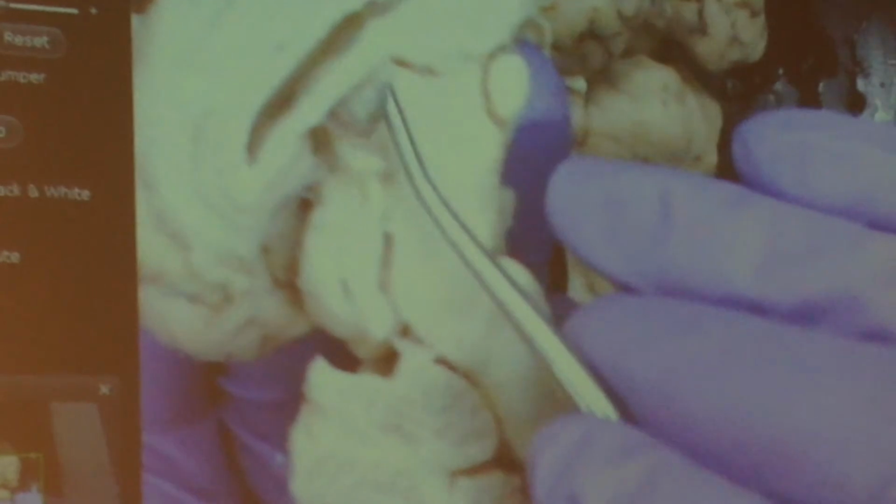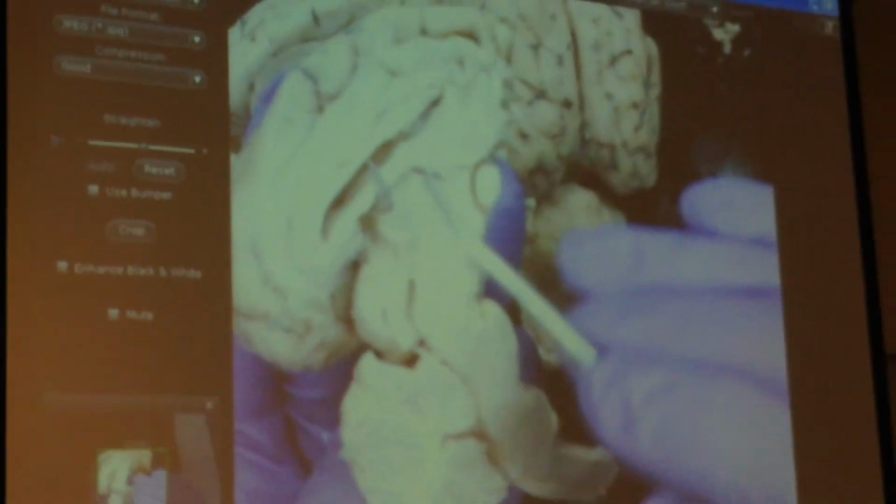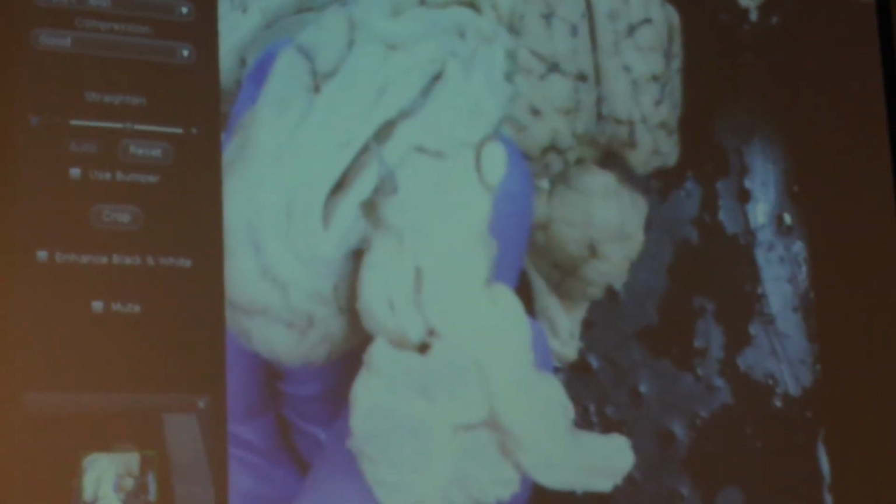What's this structure here coming out of that third ventricle? And if I dig in here, I should be able to find one here in this lateral ventricle. What is this structure right here? Anybody? Is it the cerebrospinal fluid? It's the structure that makes the cerebrospinal fluid. So what makes it? The ependymal cells plus the capillaries, which together we call the choroid plexus.